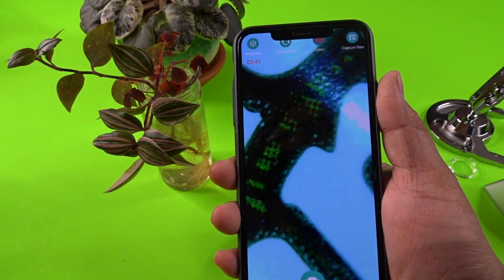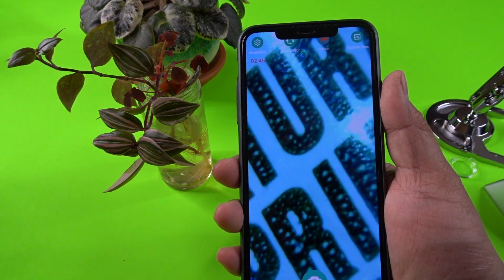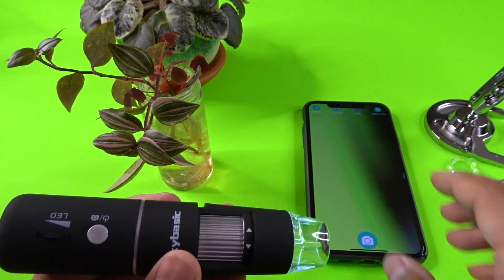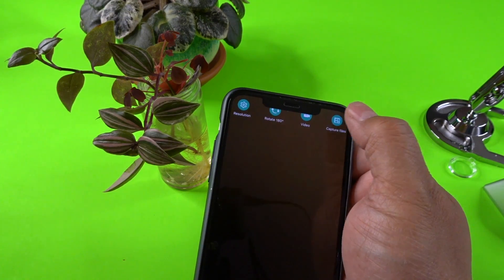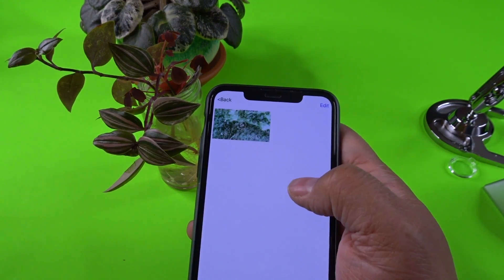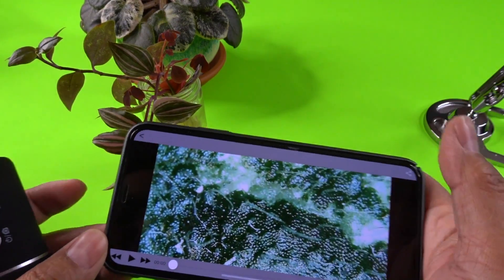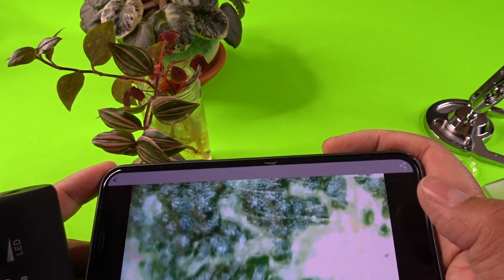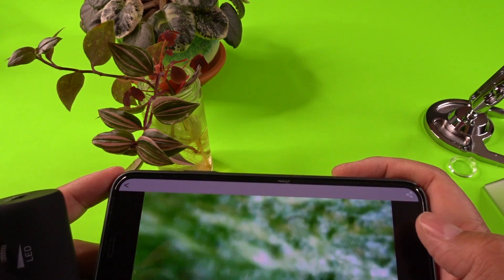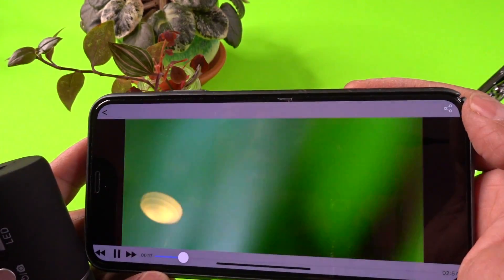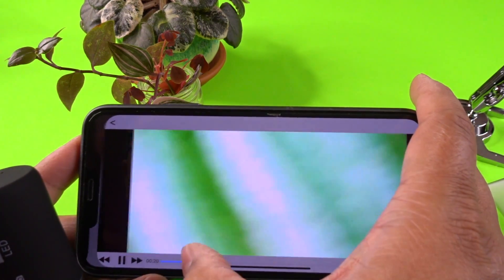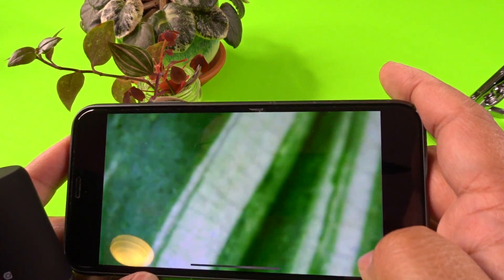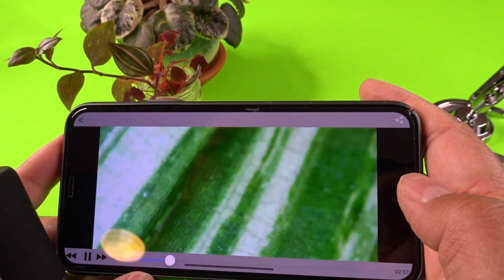This is the SkyBasic wireless wi-fi microscope. And you can see how awesome it is already. I can't wait to make use of it. But check it out. This is pretty awesome. Let me stop the recording. And you can go to capture files video and you can play back the video that I had. Apparently it does not capture audio. There's a share button if you want to share it. But there it is. Look at that.